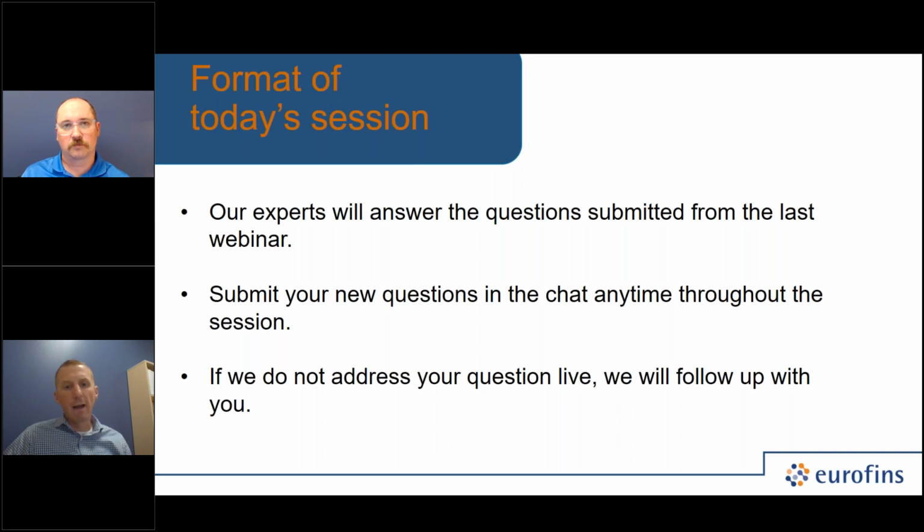Sure. I really like to think about having the dead and injured cells as a big bonus in terms of the additional information you're getting there, especially if you're doing an investigation or something like that. You can really see more of what's going on with that product in comparison to just a CFU count, which is just what's live and able to grow on the plate. So there are, in my mind, always some additional value there. Yeah, that's a good point you brought up, because it can be used as an investigatory tool.